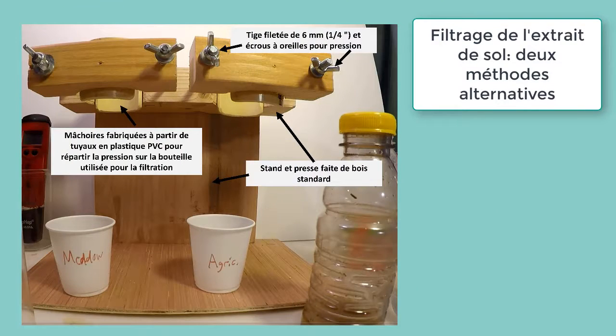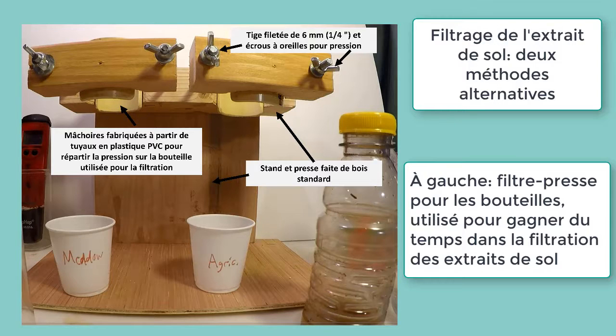Now we need to filter the soil extract to get rid of any clays that were not removed by settling. We'll describe 2 alternative methods for doing this, and for either of these it may be helpful to build this simple bottle press, which you'll see used in the following video.